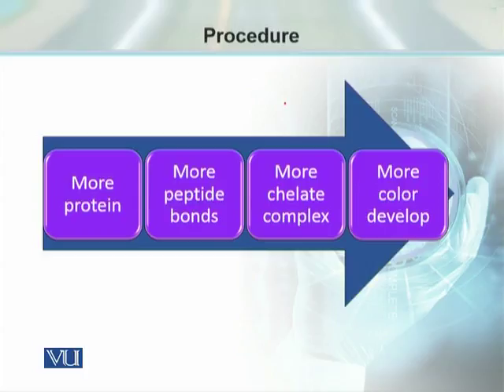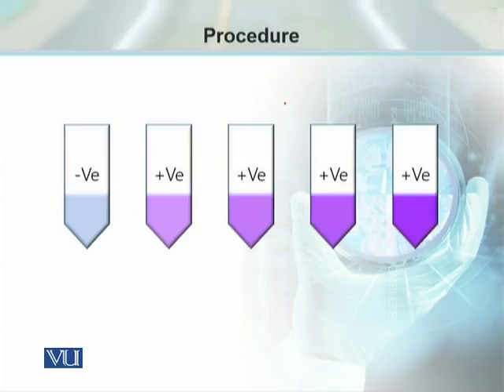And if we look at the tubes, we will have some negative result. Nothing is present, no protein is present. We normally use one negative control whenever we make the standard curve, so that we see that there is no error or no contamination. This tube shows the negative result. That means no BSA was added, no protein is present in this particular sample.